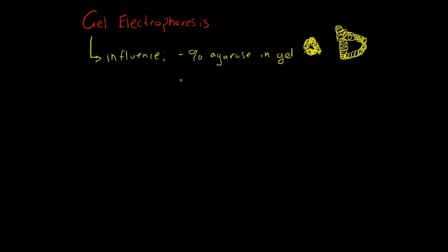So another one would be, like I said, the topology of the actual DNA molecules. Topology. So the shape, whether it is a supercoil, a relaxed circular, or a linear molecule. So those things I talked about in the last video, you can check that out.